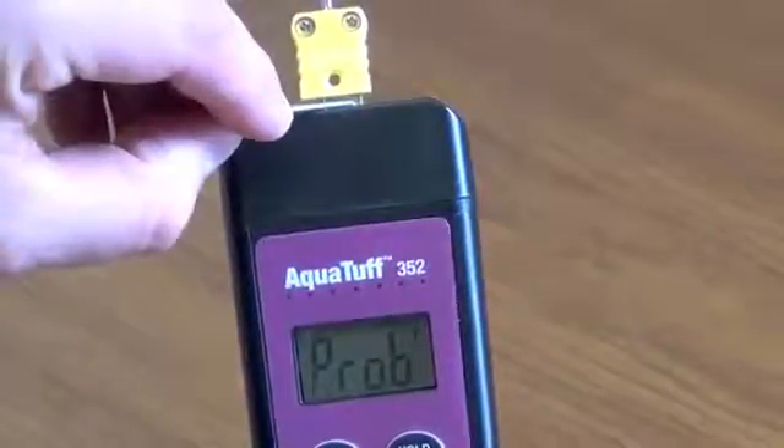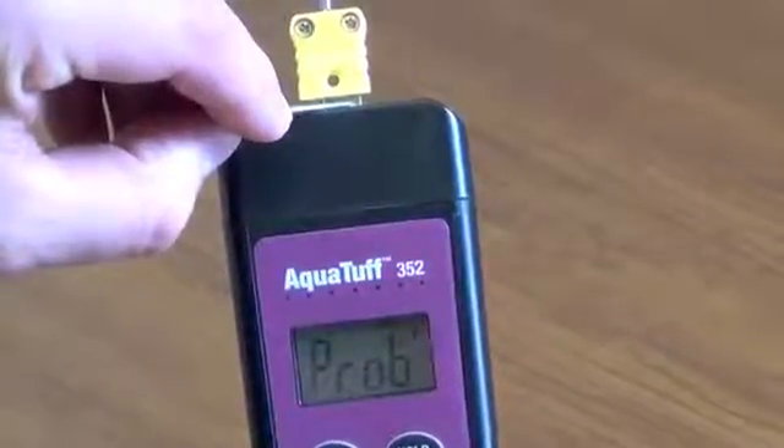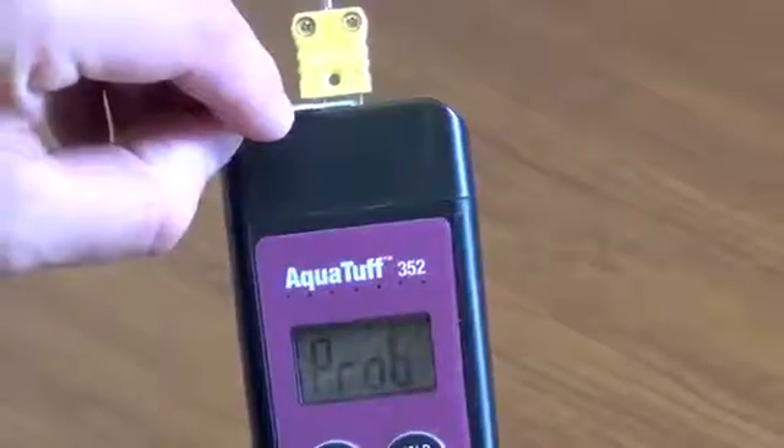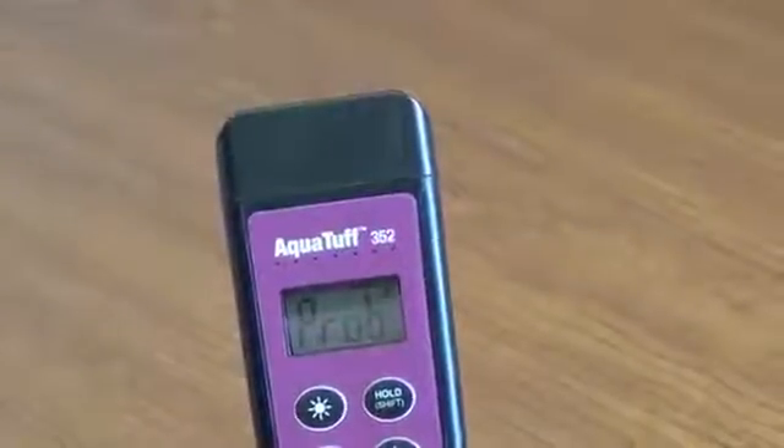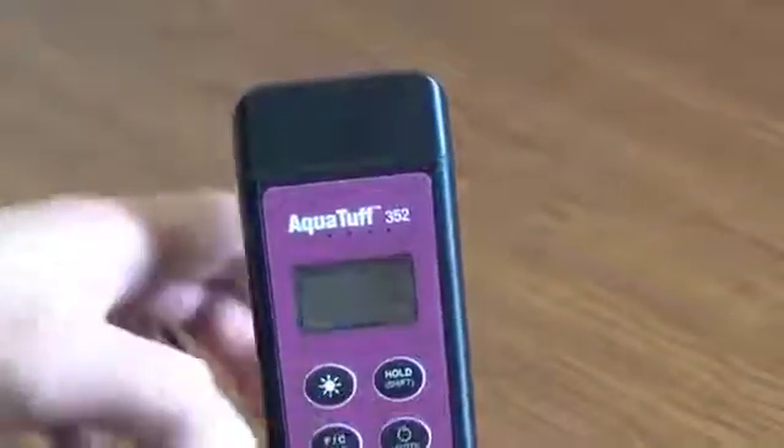To confirm if the probe is damaged, use a different thermocouple instrument and retest using the paper clip method described previously. Remove the probe from the AquaTuff thermocouple instrument. Turn the unit off by pressing the power button.